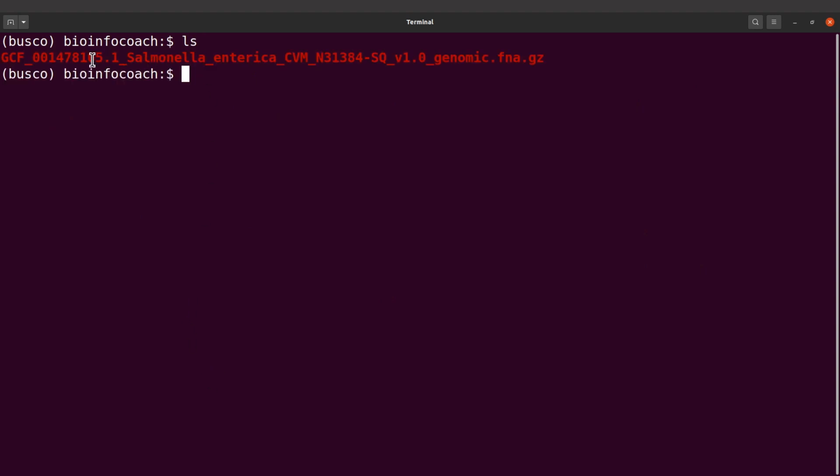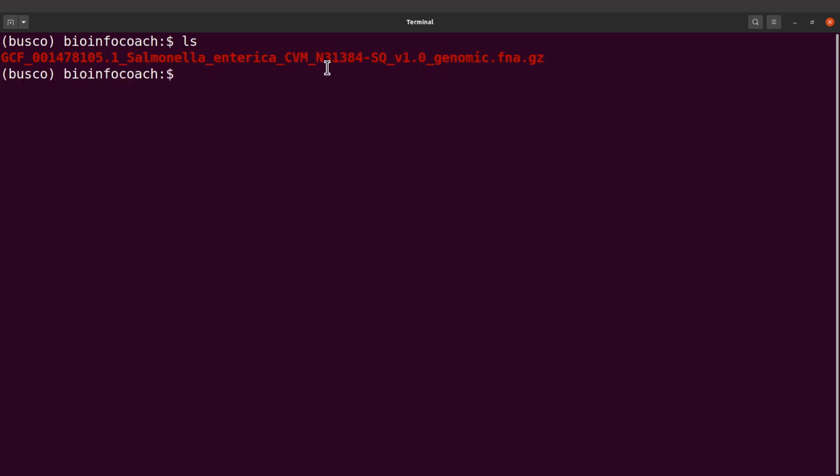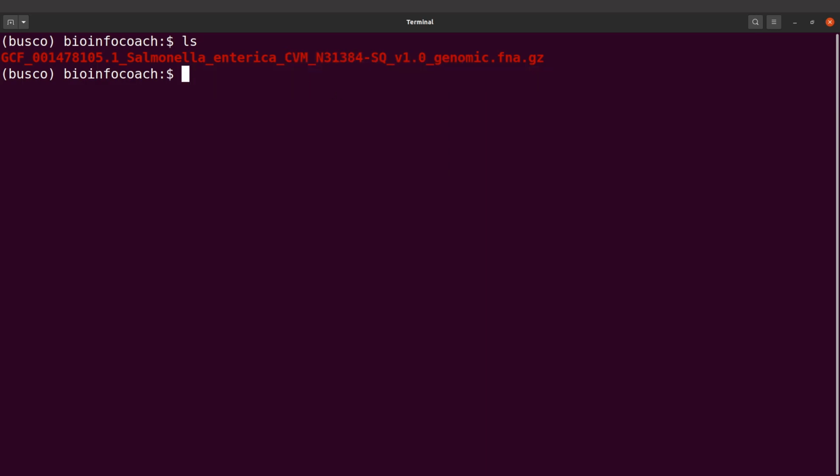The file name is also long, so we can shorten it. So for me, I'm going to rename it, by the way, before I process further. So I'll rename using this one here. This will be the new name. Okay, that's what I'll do. So what I'll do next is to first extract the contents, and then I'll do the rename. That will make things shorter for us.